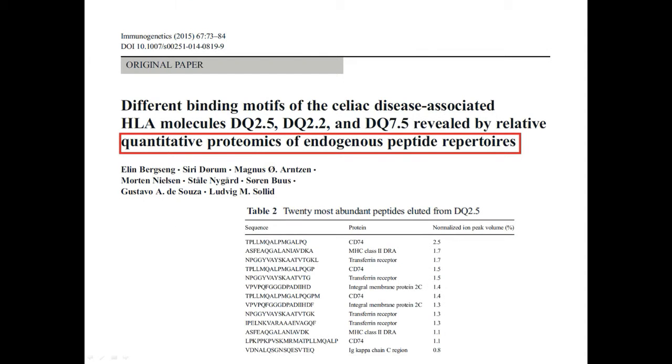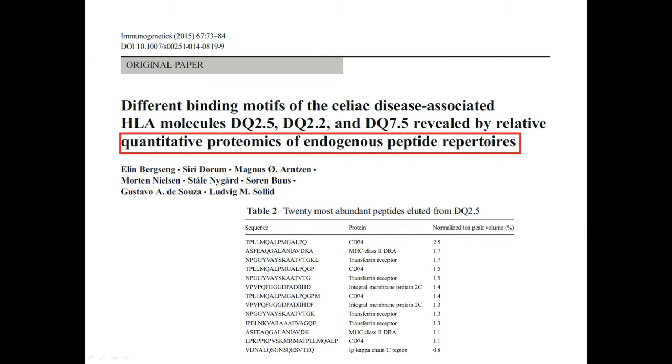This information has proven to be very informative. For example in the publication shown here they reported the normalized area under the curve of peptide features associated with endogenous peptides. This gave the research group proof of the most abundant peptides eluted from their sample.